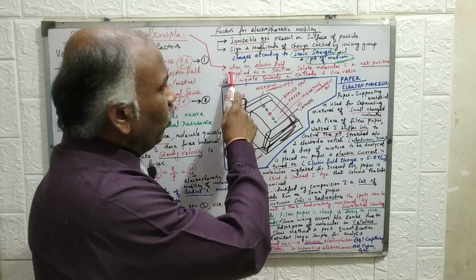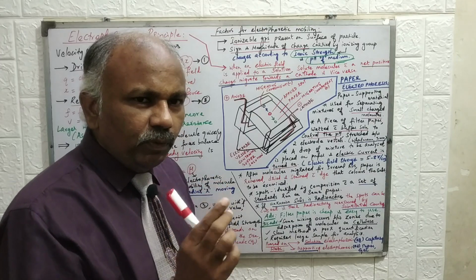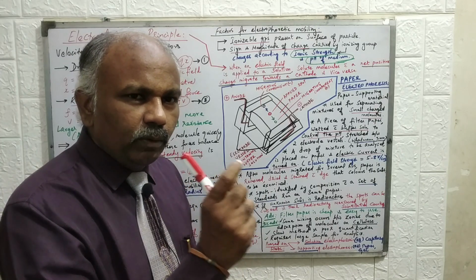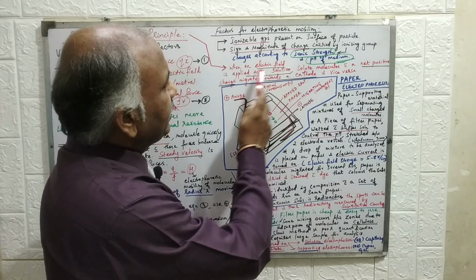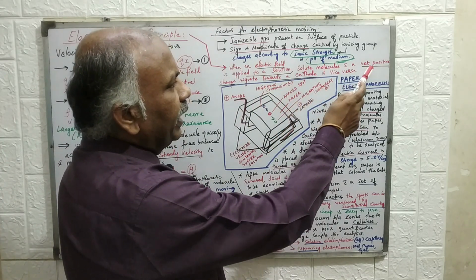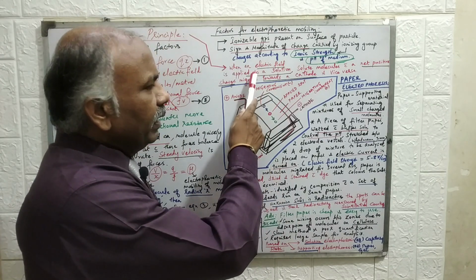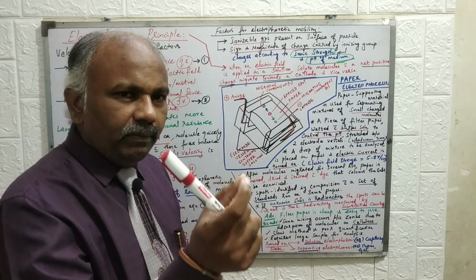Right? So what is electrophoresis? Now let us discuss the definition of electrophoresis. By applying an electrical field we are going to separate the molecules. That is called electrophoresis. So when an electric field is applied to a solution, solute molecules with a net positive charge migrate towards the cathode and vice versa. This technique is called electrophoresis. Whenever you apply an electric field to a solution, the solute molecules will try to travel.